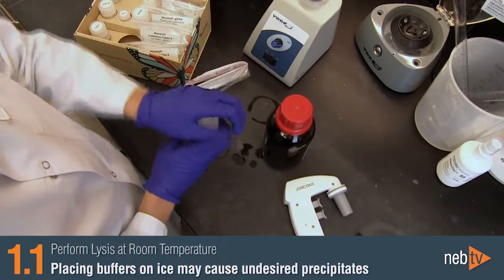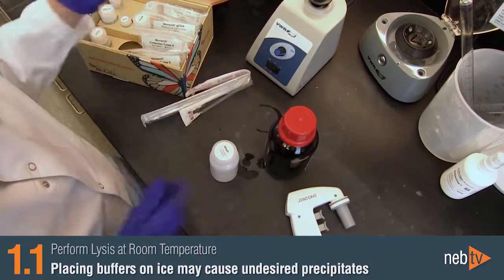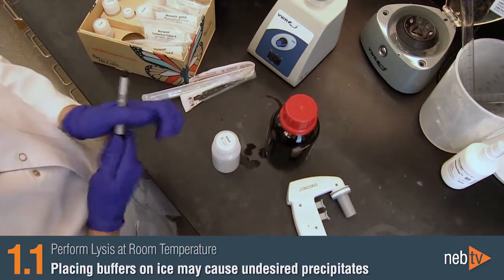Keep in mind that sample lysis and all subsequent steps of the protocol should be carried out at room temperature, and not on ice. This will prevent the formation of precipitates in the buffer.